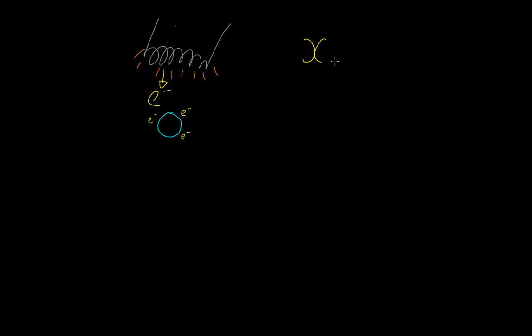So if we get our compound X and then knock an electron off, so we give it an electron, but instead of charging it negatively, it knocks off another electron, we will form, sorry, wrong thing, I was going to put a plus, let's get rid of that. We will form a positively charged ion, and we will have 2 electrons remaining, because we've thrown 1 electron at it, and then we have knocked an electron off.